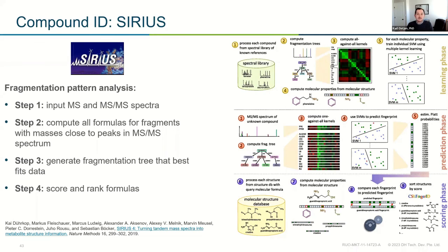So this can be really powerful. I use it all the time for searching big databases like PubChem, where I want to say, hey, is this present or not? And again, we'll go into a lot more detail about what's actually happening with some of these next time. And we'll also talk about the tools that we have here at SCIEX that you can use that are readily available.